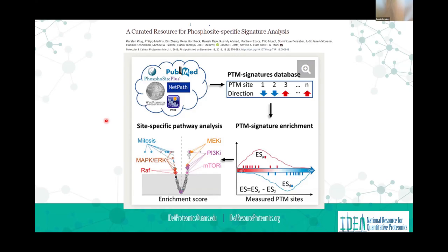And so Ingenuity is probably the worst about this. You can get an Ingenuity pathway with phosphorylation. What does that mean, right? What site is associated with that? And that information is not there. And so this is a good resource to use to follow up your data.